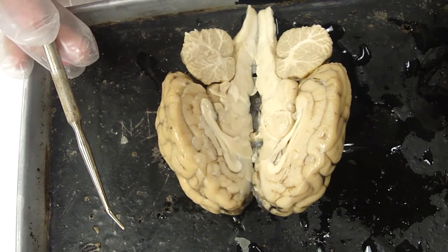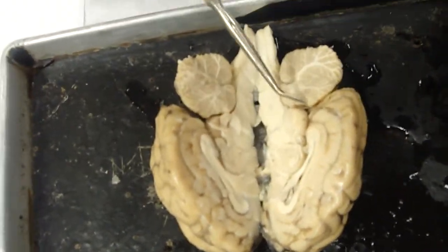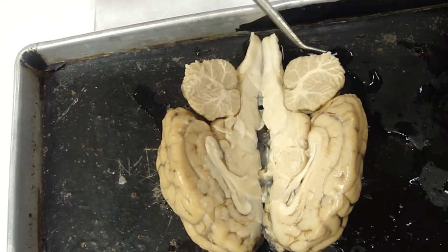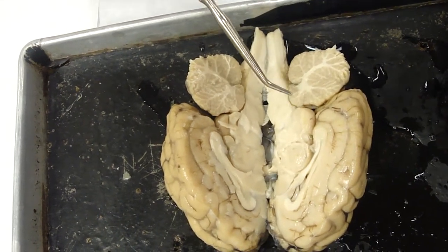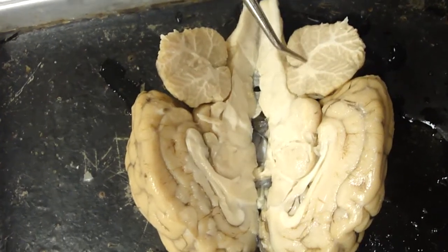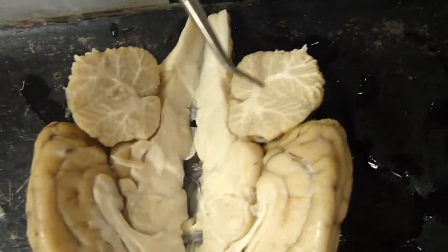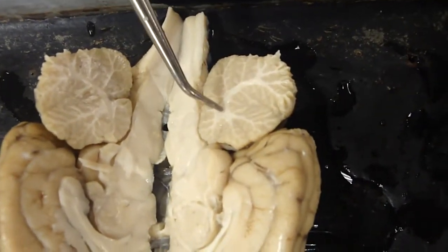Okay, looking at the half here, here's the cerebellum in the sagittal section. We can see that there's two kinds of material in the cerebellum. There's this darker outer gray matter, and then there's a branched pattern of white matter. The branching pattern of the white matter is called the arbor vitae. It means tree of life, the branching tree-like pattern.